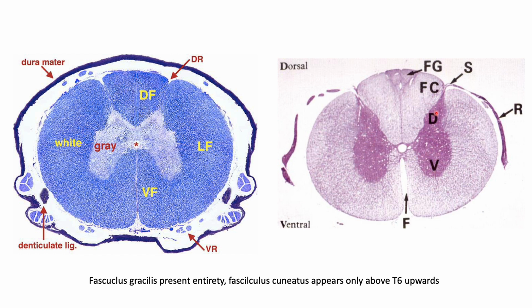The gray matter is divided into a ventral and then a dorsal horn. So ventral horn, dorsal horn. When you look at the dorsal funiculus, you can see that there's a portion which is demarcated from the lateral portion by a sulcus. That region you find here, that is the dorsal funiculus, is also called the posterior column.